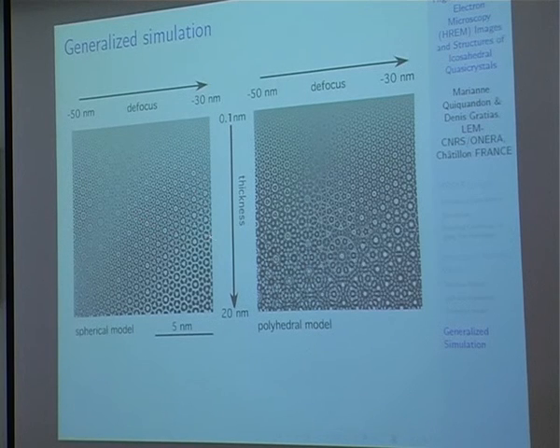But at larger thickness, you can see the difference between the two models and between the two simulations. As a conclusion, I can say that the dynamical calculation has to be performed with Q bases with large enough perpendicular components, because large enough perpendicular components are needed to take into account the quasi-periodicity of the materials.